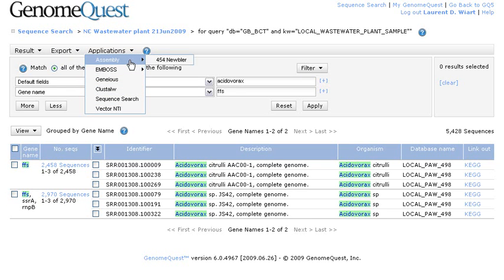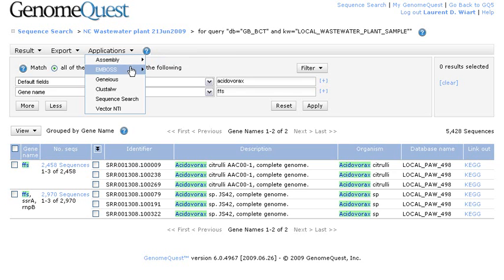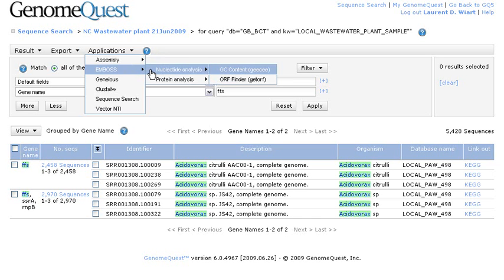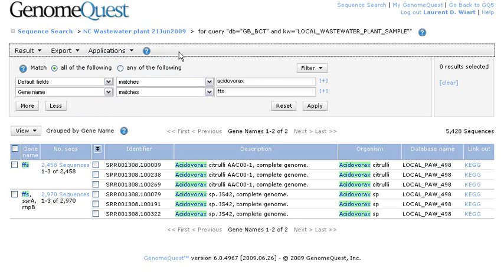We could launch an assembly on those reads with the assembler, the newbler assembler from 454 or even perform some statistics on the set by using some of the Emboss applications like GC content or Finder, etc.